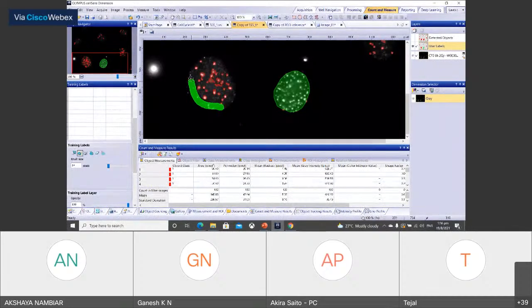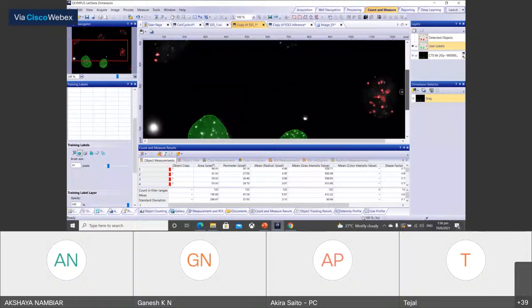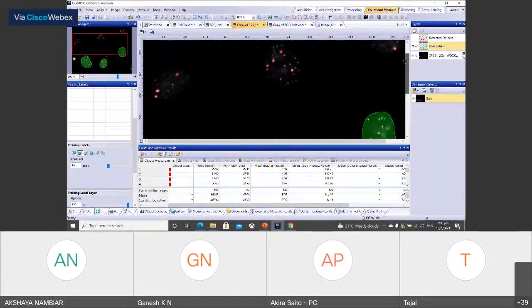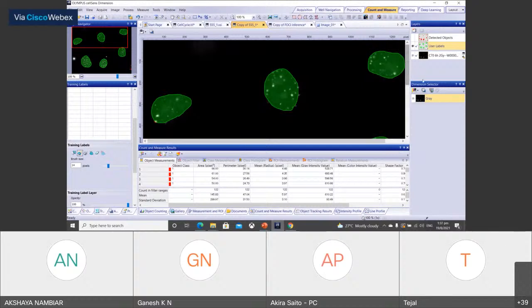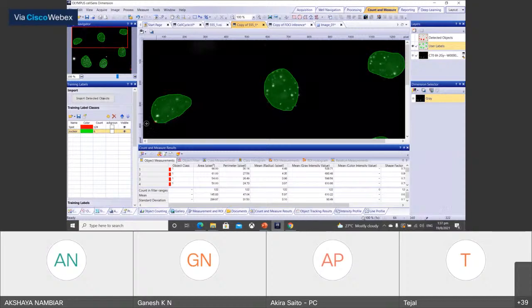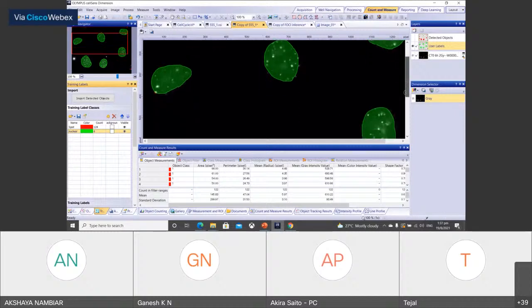So I'll just use manual labeling. Okay, so I have two different classes over here, one for spot and one for the nucleus.